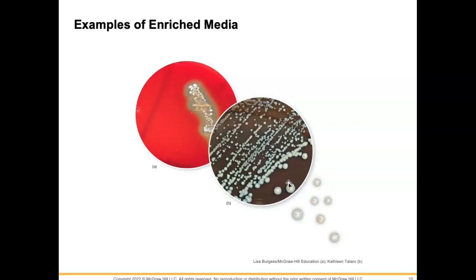and it doesn't have chocolate in it, by the way. It's actually boiled blood, and it changes the color to a chocolate color. So you can see here that this agar was all blood, or all red at one time, and then when we put the sample on here, the microbes ate up what was around them. Now, it didn't eat the agar because we said that it's not consumable by microbes.